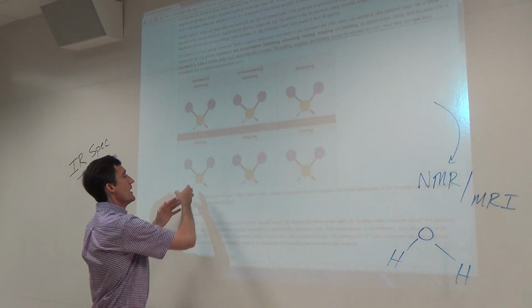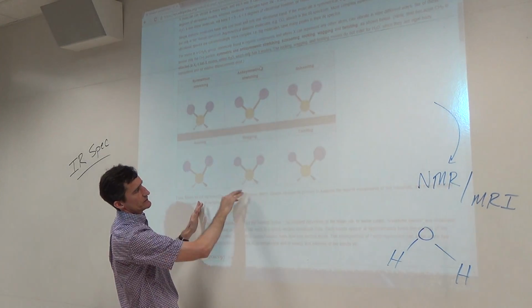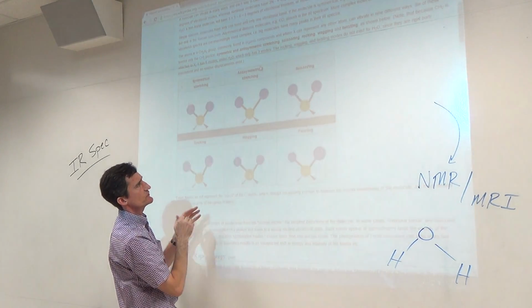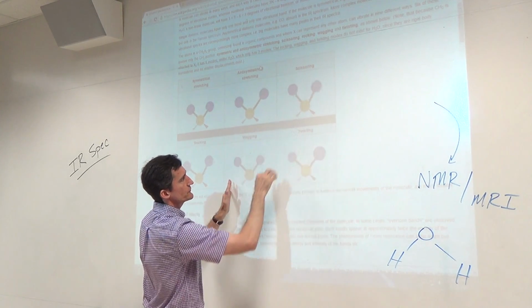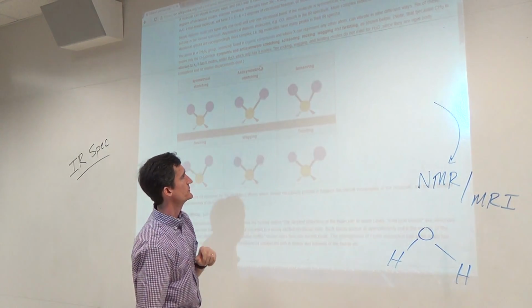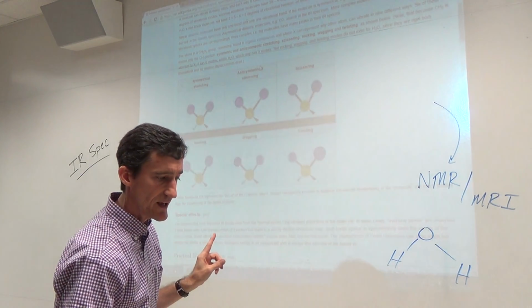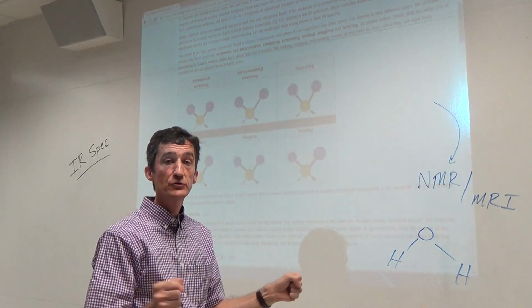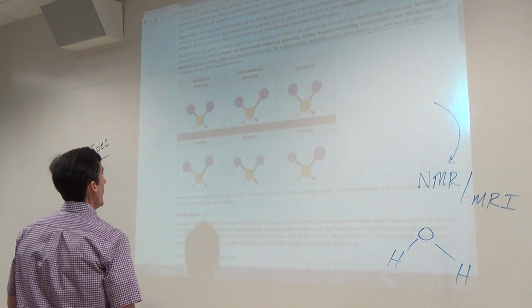Okay? Most of these frequencies, it looks like in this page here, all the frequencies are pretty similar. But that's not actually correct. This one may be very fast, this one may be very slow. Lots of frequencies leading to lots of absorptions. Most of these are all in the fingerprint region. Again, most of the peaks that we will decipher and assign are going to be usually 2-atom bond stretching. Okay.